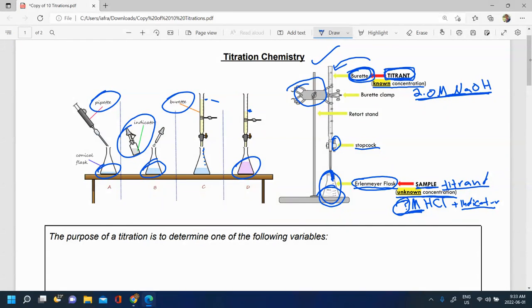Essentially, you can figure out how much of the known stuff you added by just looking at the initial volume and the final volume and finding the difference between them. So whatever this difference is, this is how much of the titrant you added to your acid to get a reaction. And once you know that volume, you can do some stoichiometry calculations to figure out what your unknown concentration must have been.